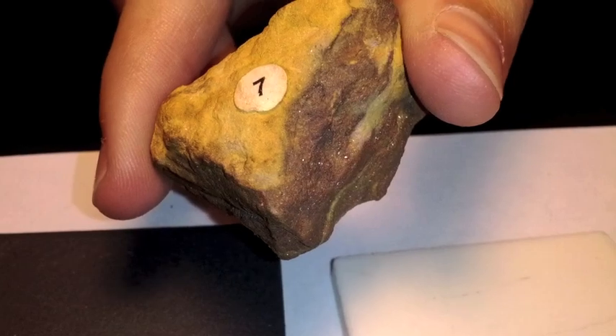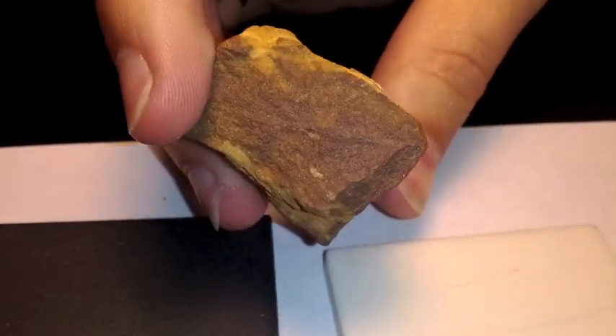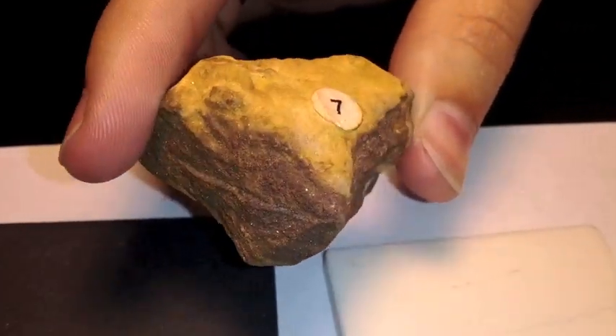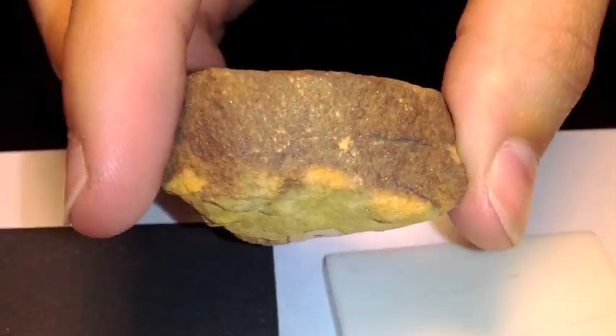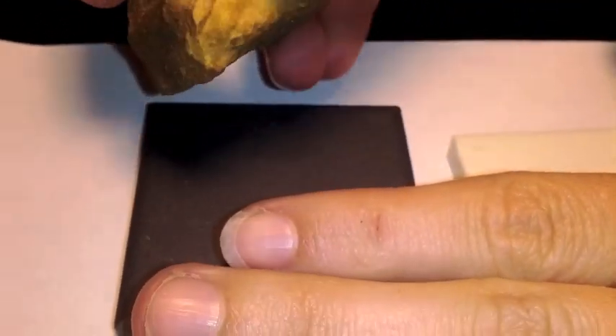This is number seven. The mineral is called Limonite. If you look at the colors, there are a couple of different colors in the mineral itself. I want you to write those down. The streak leaves a yellowish-brown streak.